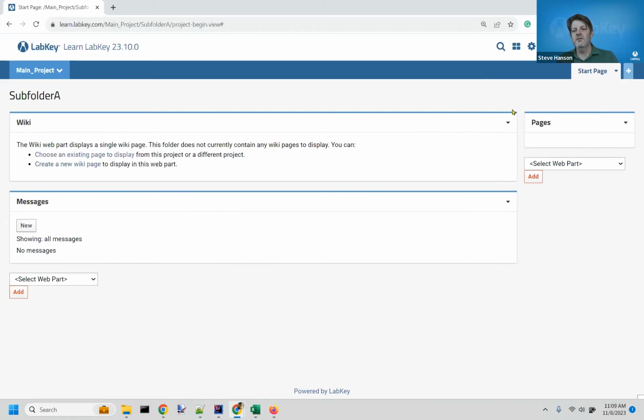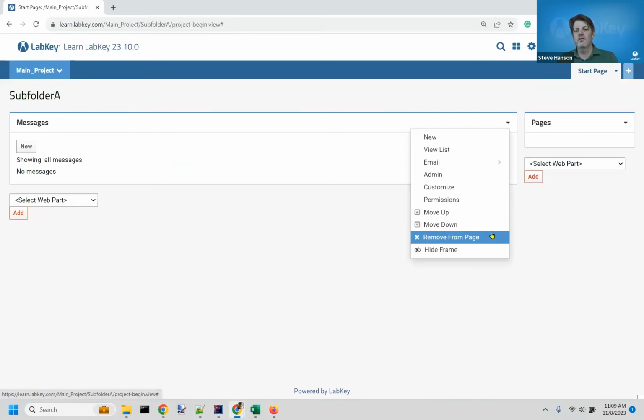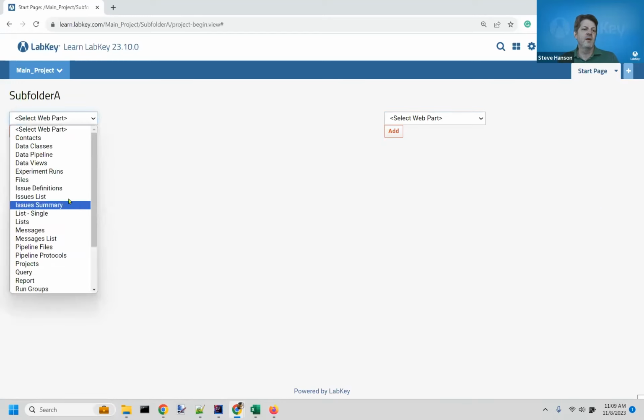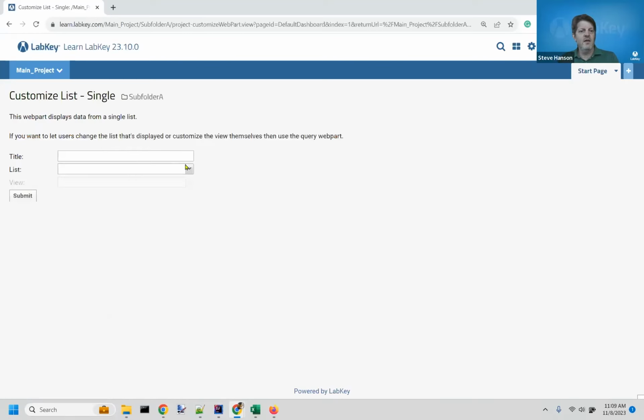I don't want you or you or you or you, but I do want that table, which is available. Sure enough, it's, wait, where are you?